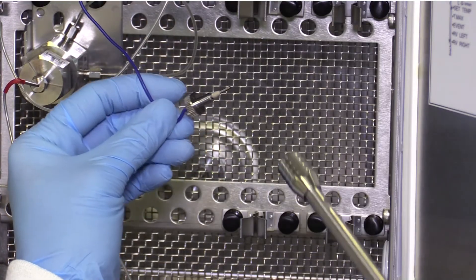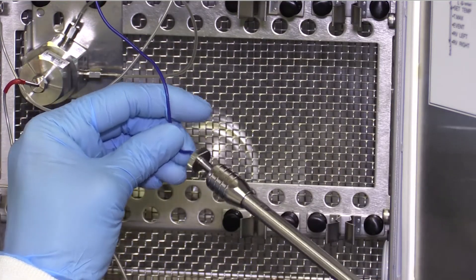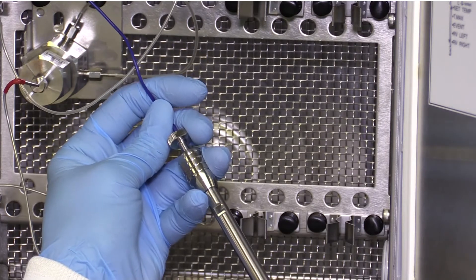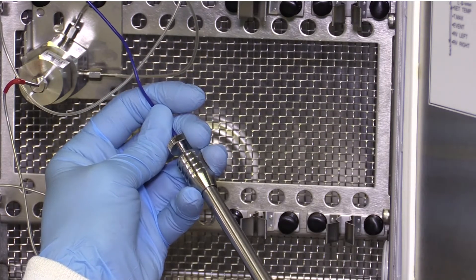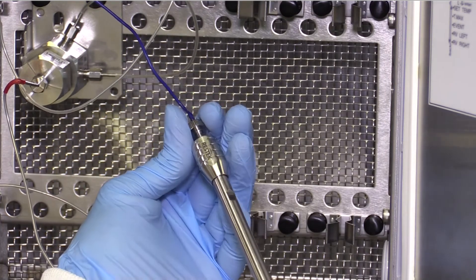As far as fittings go for stainless steel tubing, we recommend the EXP type. This has a metal nut and a ferrule with a polymer cone that fits into the port, and a metal portion that connects to the nut. So no matter what type of system you have, we've got the tubing and the fittings that will keep you up and running.